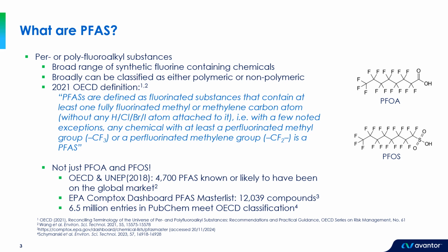So what this means for our analysis is that potentially we have a monumental number of potential target analytes. And this definition will also be impactful when it comes to restricting PFAS. So, for example, there are many pharmaceutically active ingredients that would fall within the scope of this definition that clearly we may want to avoid restricting in the future.